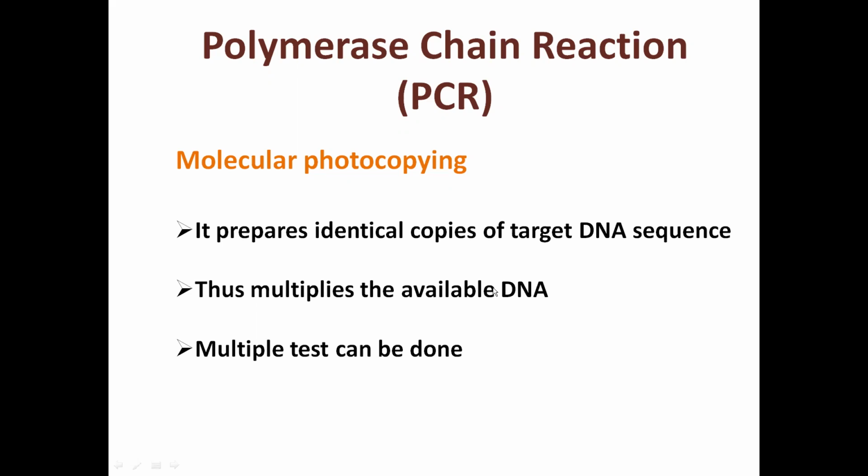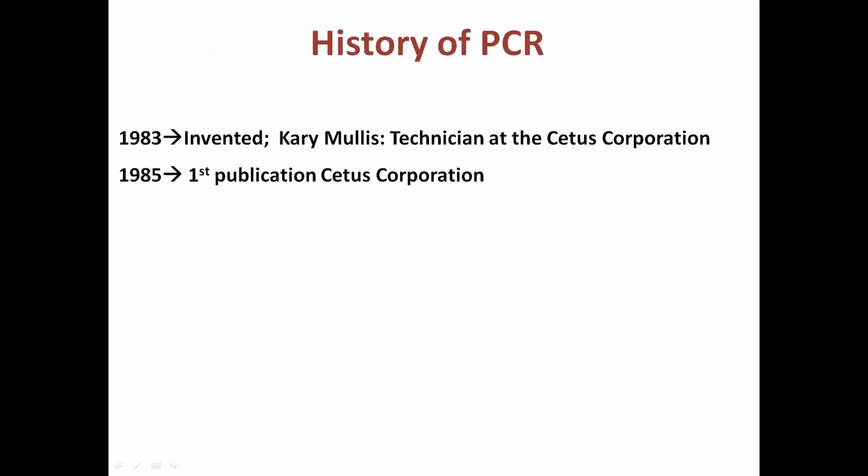We can design multiple experiments to get multiple objectives, which is not possible if we are not able to amplify the amount of DNA samples available to us. It is only possible because of the PCR. So before going to the details of the PCR, we should revisit the history of the PCR.